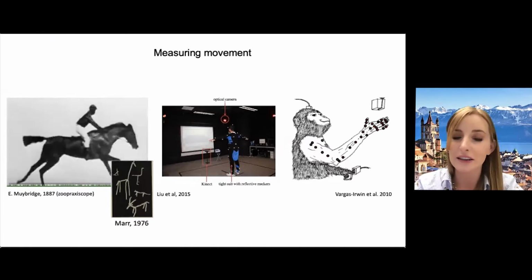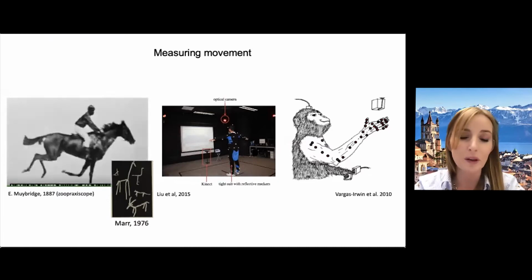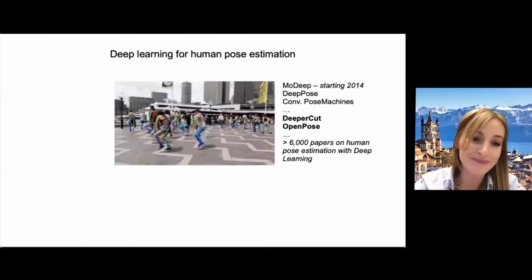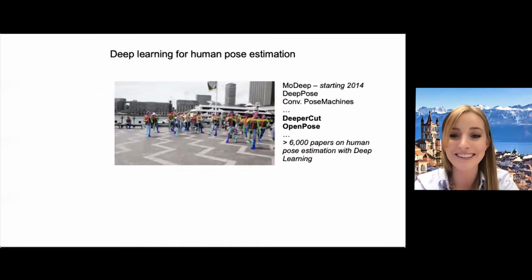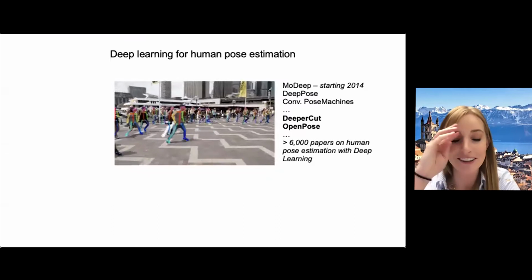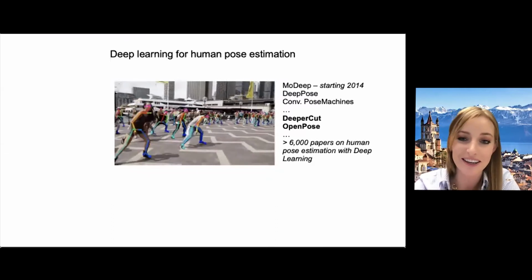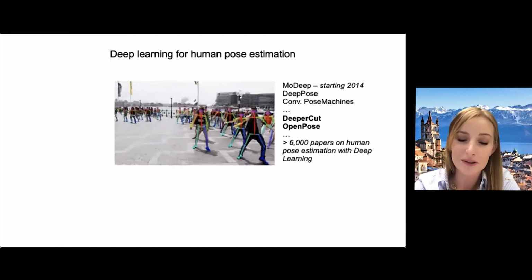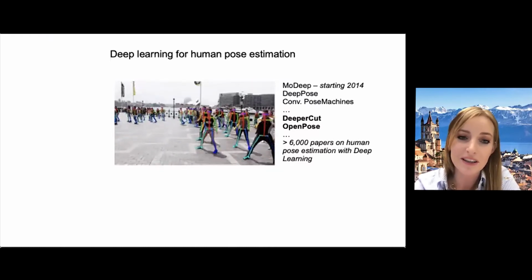And then, of course, there are things like aquatic animals or mice. I actually run a research laboratory. I'll skip a lot of stories, but they don't like wearing costumes. Over the years, we really kept an eye on the computer vision field, and we saw that human pose estimation was getting remarkably advanced. So we thought, okay, how can we imbue some of this really beautiful computer vision work into animal pose estimation?